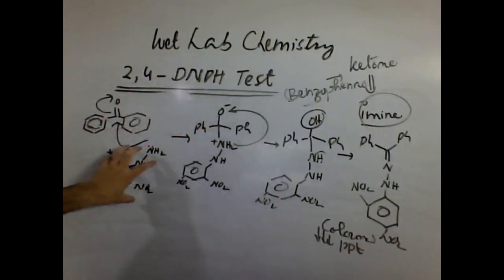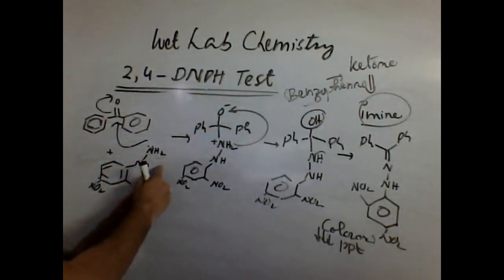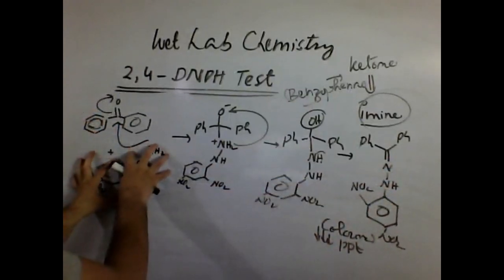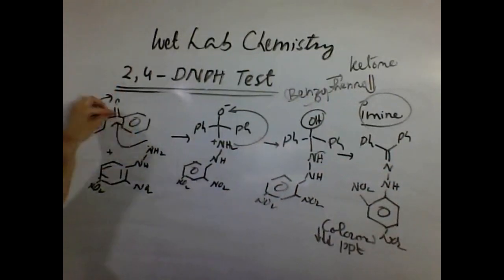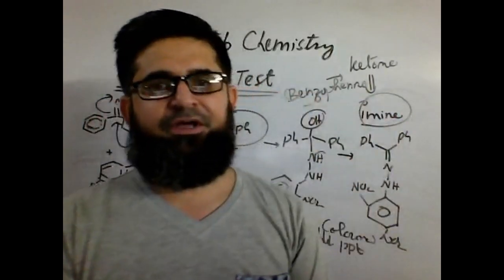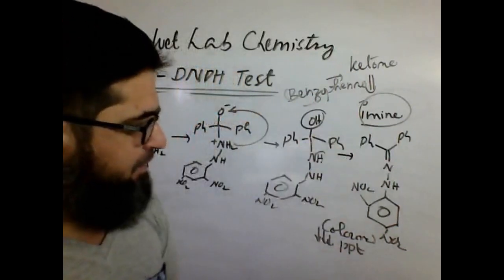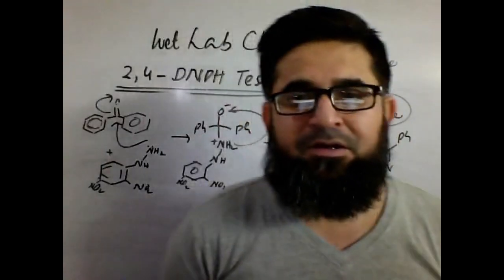This reagent has been added by ourselves, so we have an idea about its chemistry and structure. So if this has been produced at the end, then it means the carbonyl compound was already present from our side. The given unknown would be some sort of a carbonyl compound which has undergone nucleophilic addition, and then the corresponding imine has been generated after an elimination of water from the alcoholic product, and the colored precipitate represents that the carbonyl functionality is present.